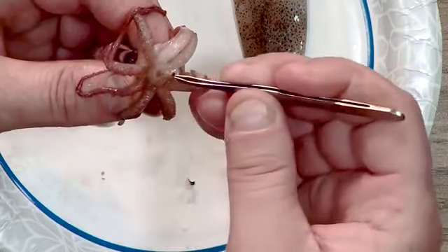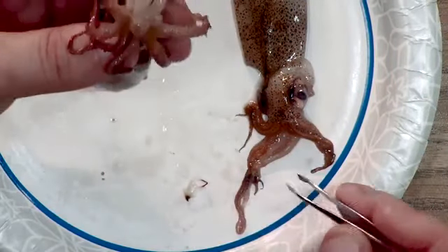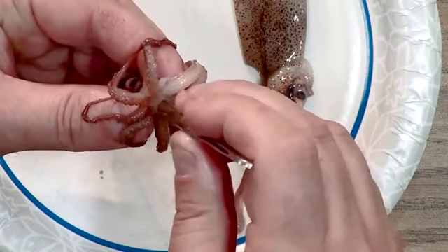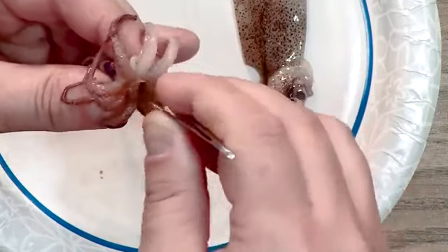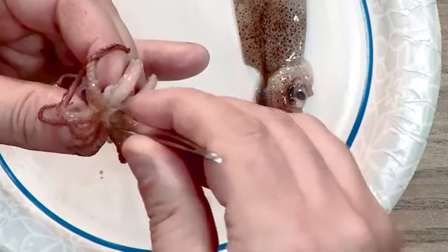I'm going to do the same thing. Oh, easy does it. And I've got both pieces now. Both pieces of that beak are out of the way, and that allows me to really open up the mouth here. So using my tweezers, I can dig or cut in a little bit, and this is why the metal ones work really well.